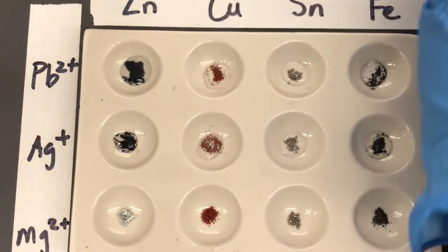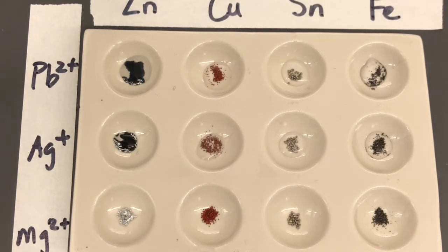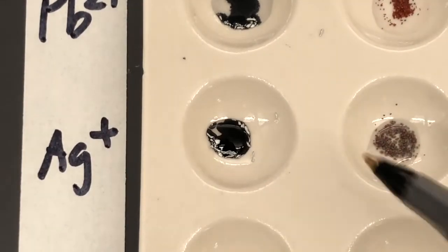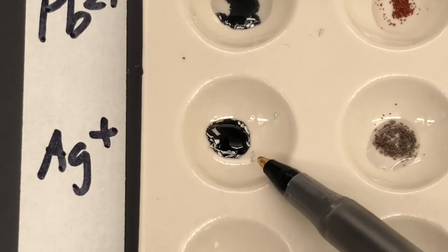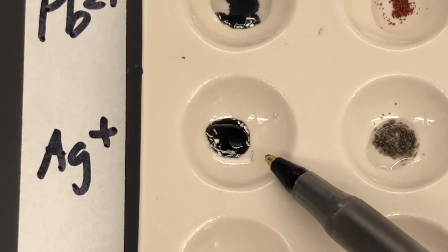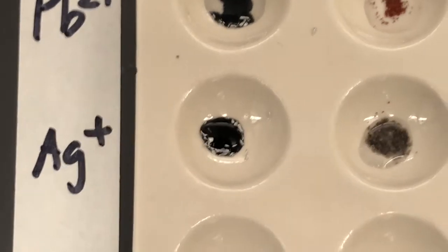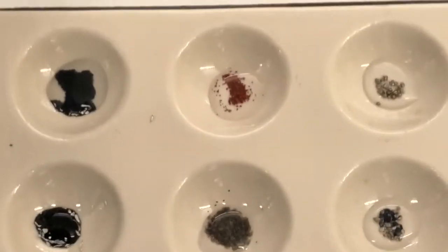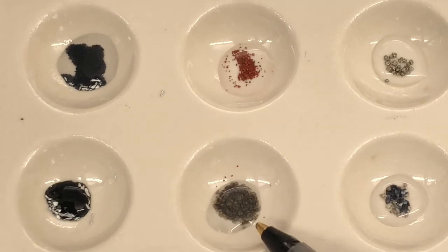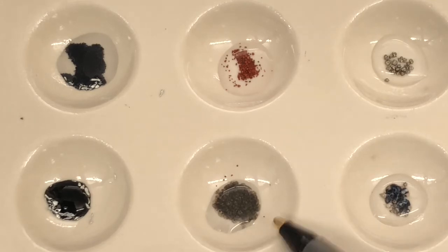All right, as we look at these, we'll take note of what is happening. We'll start with the zinc. The zinc, like we've seen with some other examples, immediately starts to turn this black color as a reaction begins to take place. When we move over to the copper, if we contrast that with the copper that was mixed with lead 2+, now the copper that's mixed with silver 1+ never looks like it has that copper color anymore. A precipitate is definitely forming there.